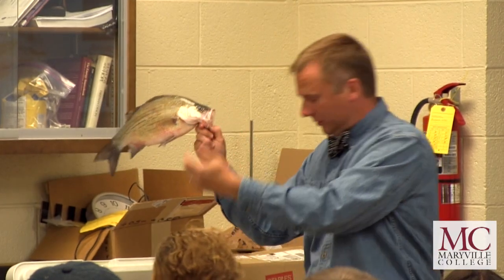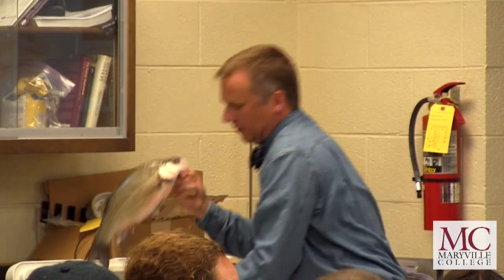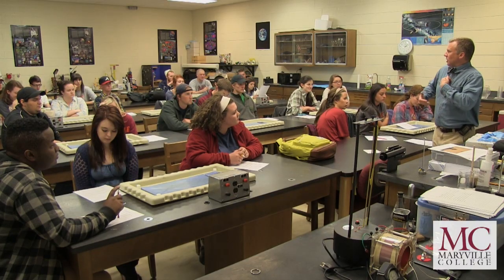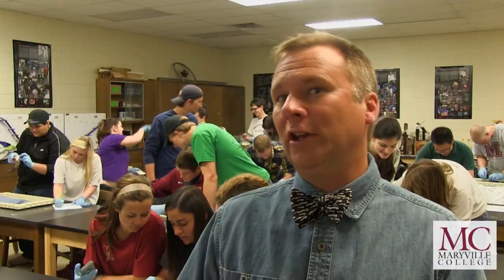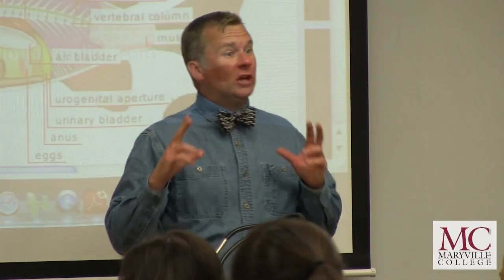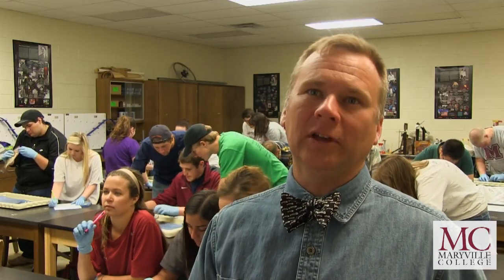So this is a white bass. This is a largemouth. We do one dissection lab in this biology class for non-science majors. It brings the lecture into real life for my students. When they're studying for their exam, they're not just looking at notes on a page, they're remembering this lab. And when I ask, where would you find this structure, they're able to identify it, not just from a two-dimensional book, but from a three-dimensional reality dissection.